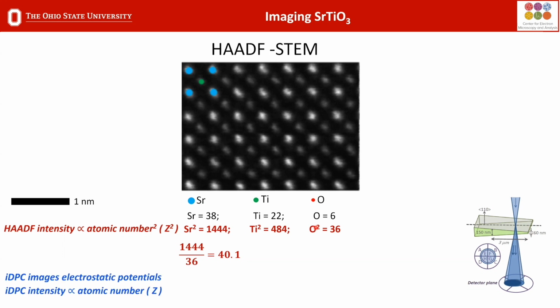And so out of this high angle, there's a very low probability of oxygen, which has a low scattering potential and a low ionization cross-section. There's a low potential of the beam interacting with oxygen and getting scattered out to some high angle position. It will happen, but it's just extremely low probability. So we will never collect long enough to see the oxygen. And even if we did, displaying it with a 40:1 contrast ratio makes it almost impossible to display in a fashion that we can see in the image.